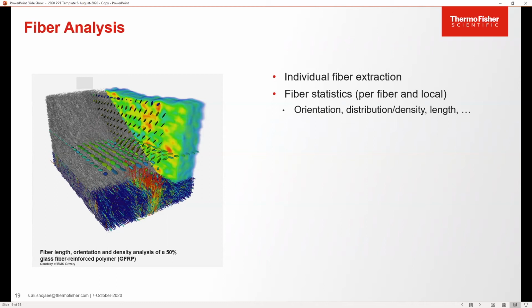So there is a way to essentially identify and segment each individual fiber, even if you cannot fully resolve that fiber just by looking at it. So there is a way to go around that limitation that you have for this very specific case of fiber. It's a process that we call cylinder correlation. You can essentially extract individual fibers, even from complicated images, like the image that you see here.